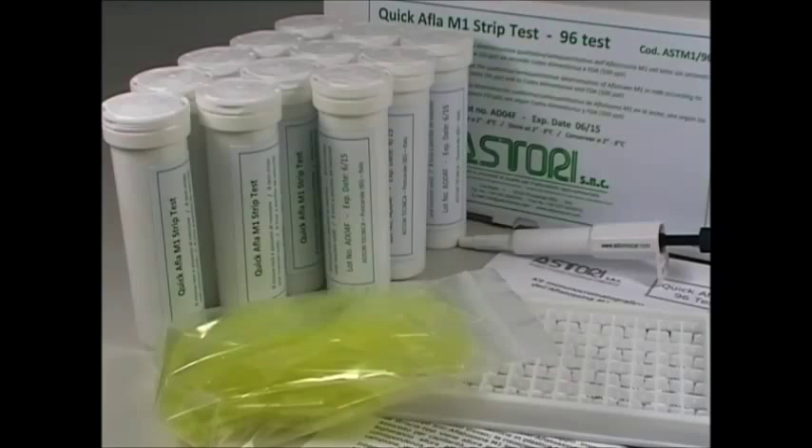The Quick Afl-M1 Strip Test is a rapid test for the determination of Aflatoxin M1 in milk according to European limits, Codex Alimentarius and FDA.